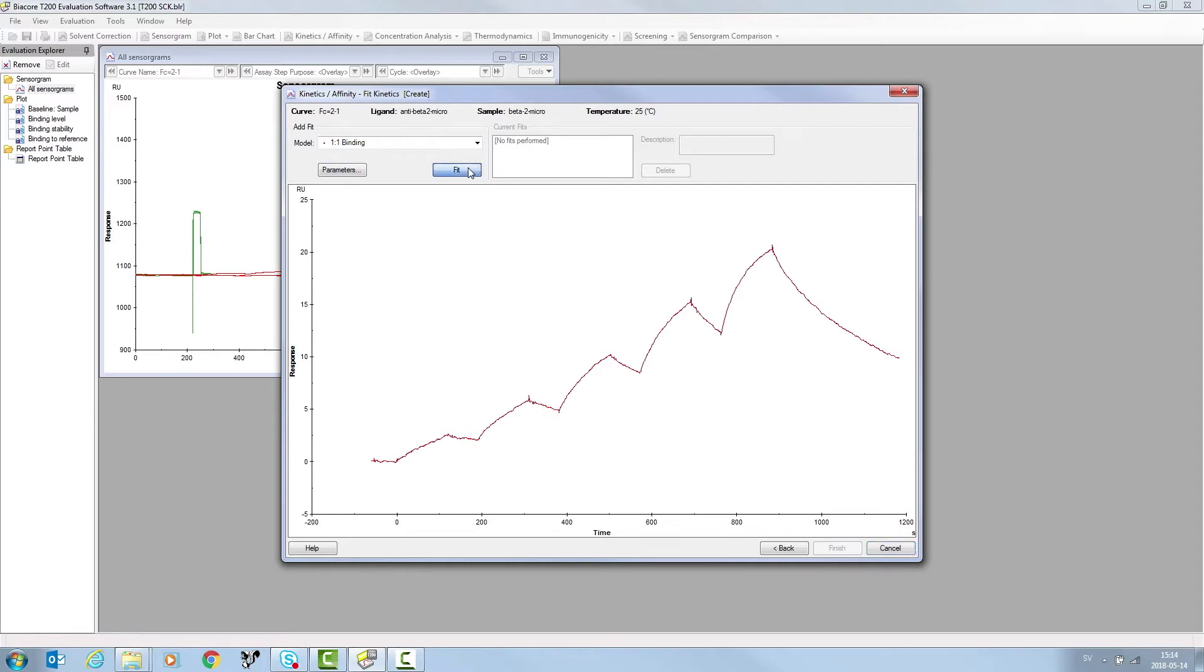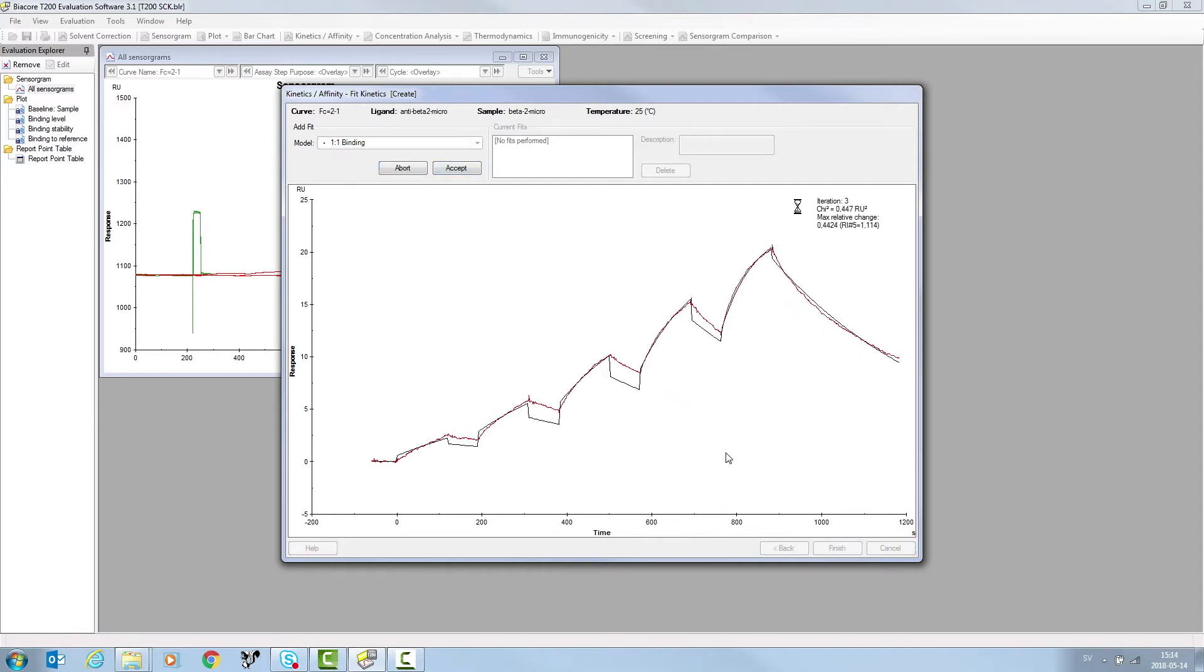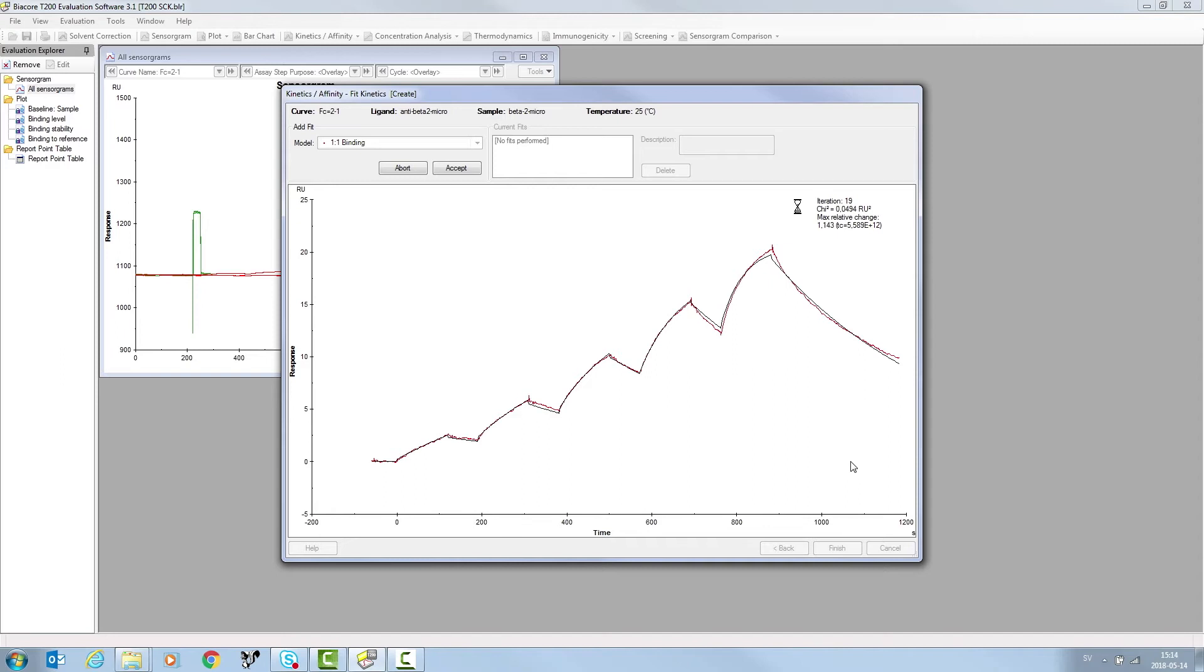Click Fit. The fitted data is displayed. The red curve indicates the sample data, the black curve, the fitted 1-to-1 model.